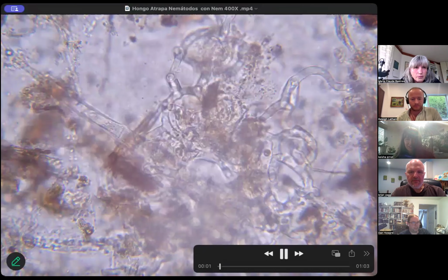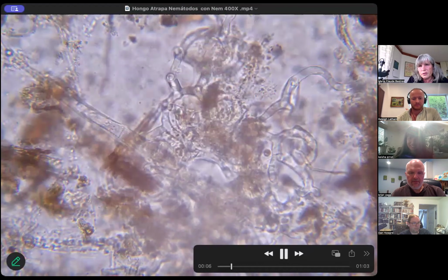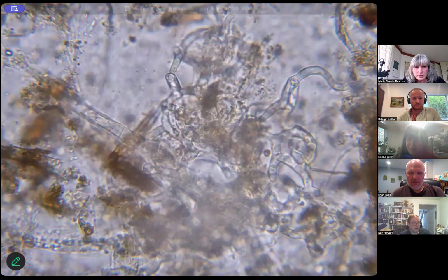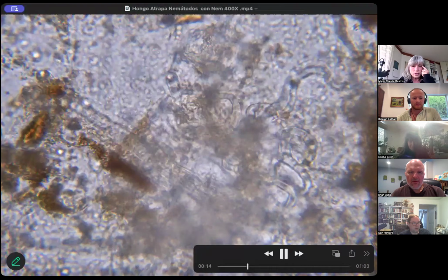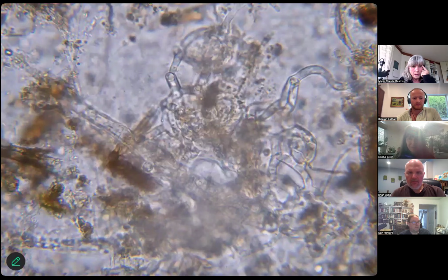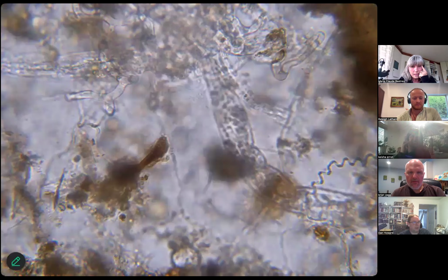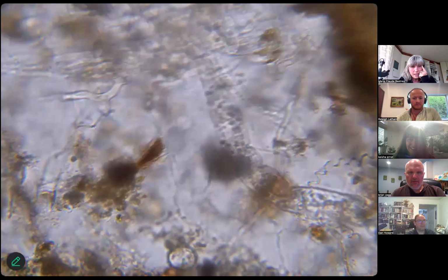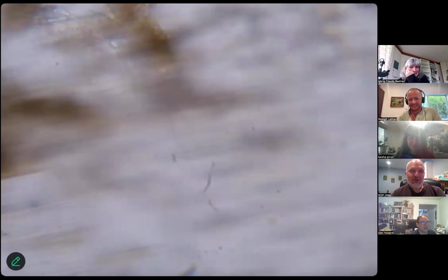I don't know why I cannot make it bigger. Can you see it? Yeah, I see it. It looks fine coming in for me. Full screen? Yeah. So that's where a huge nematode is in there. That's crazy. It's almost like a lace of traps. Good luck getting through that. And that's the tail. Danger zone for nematodes. It is a minefield. Nematode, avoid.